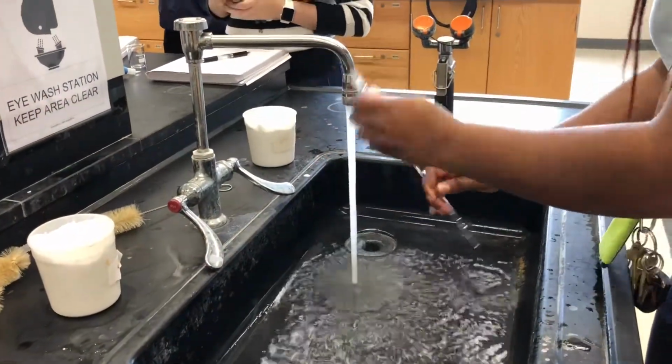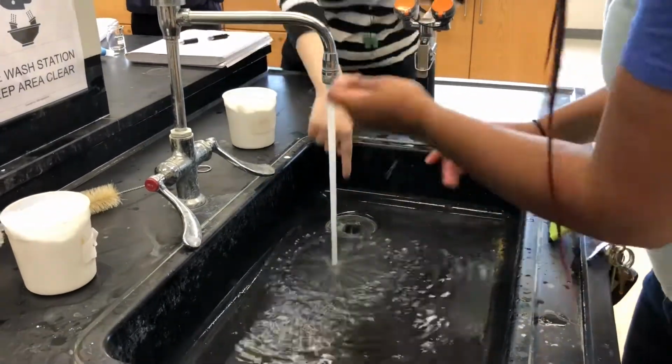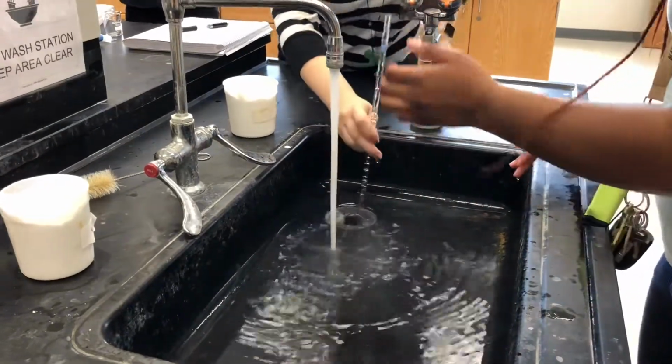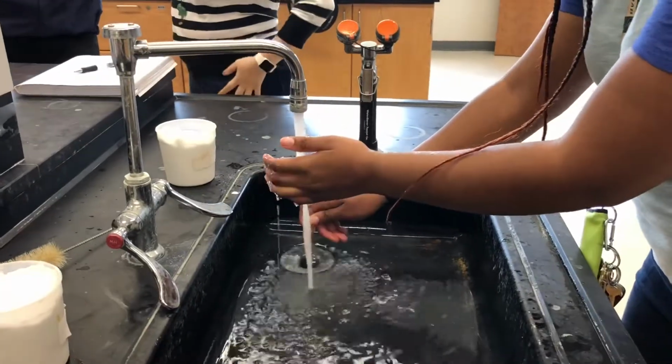To begin the process of pipetting, the pipette must be rinsed clean of any previously used chemicals. To perform this process, the pipette must be filled with water and tilted back and forth as shown, before being emptied. This process should be repeated 3 times.